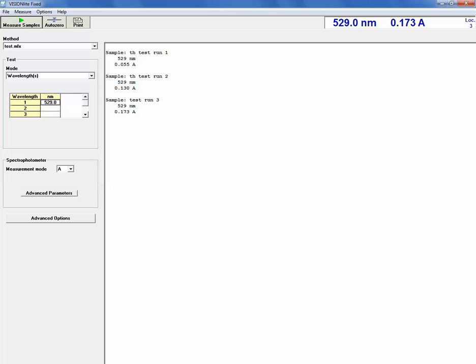Scanning is used to figure out what this number should be. So, honestly, what will happen is that we'll bring you into our lab, we'll give you a sample, and we'll say scan it in this window. When you find your lambda max, make your measurements according to the lambda max. So you'll scan it first, just like we did in the video series. Once you find that number, we then go into the fixed category and we type in that wavelength to analyze the samples with.